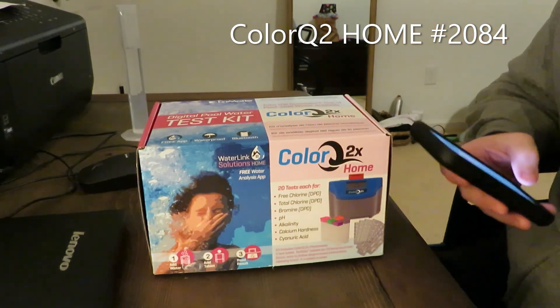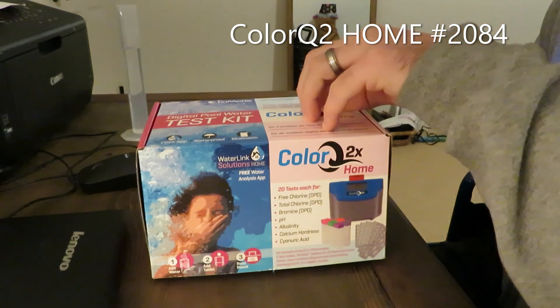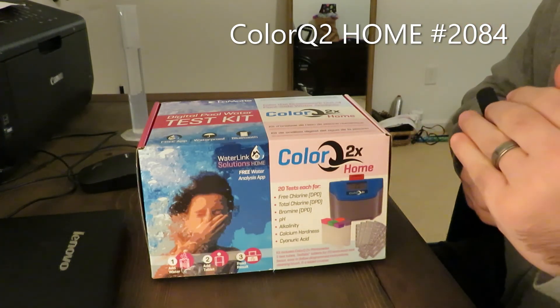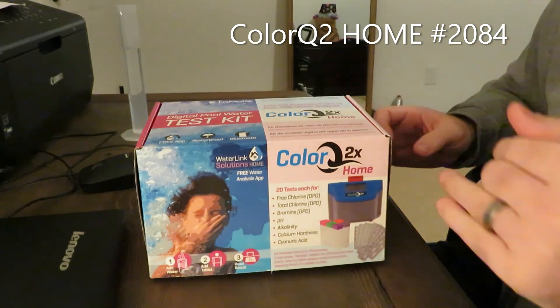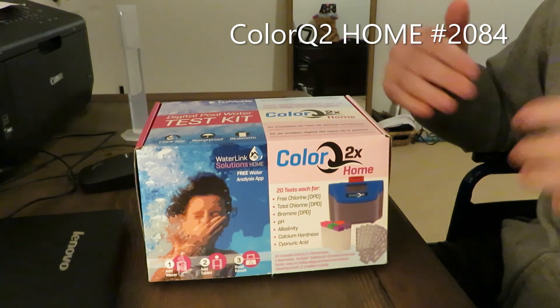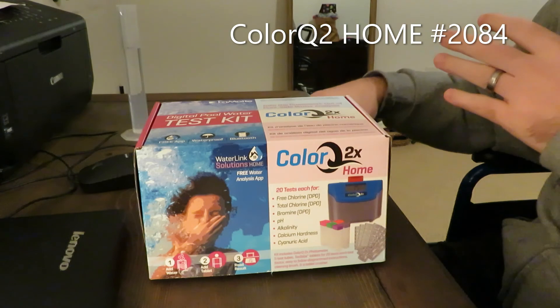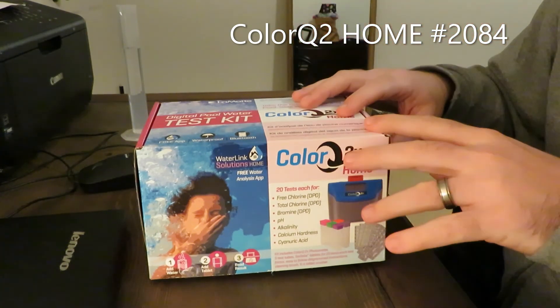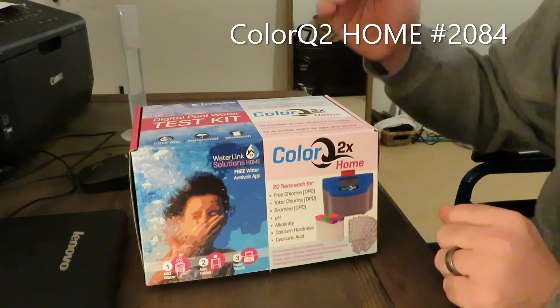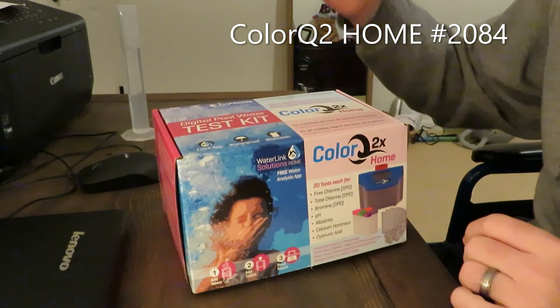In my personal opinion, the best part of it is it comes with Bluetooth and it's got the Waterlink Solutions app. When you get your results, you can send them directly to your iPhone. It will input them in your phone, saves all of your results and testing levels, and it will also give you recommendations based on your levels as to what you need to put in your pool and how much. That saves you an additional step — the app does it for you. It's called the Waterlink Solutions app, it's free, and it will say things like 'your pH is low, you need to add X amount of soda ash.' It saves all of your calculations and keeps your full history.